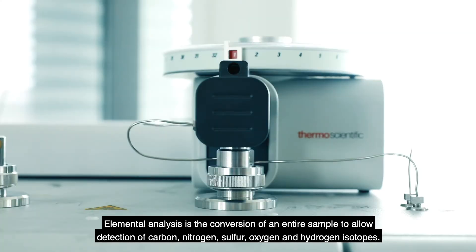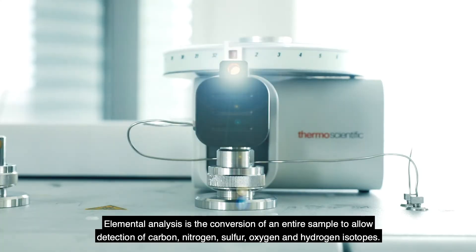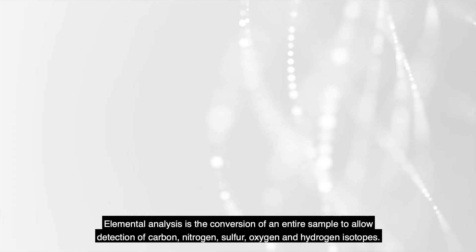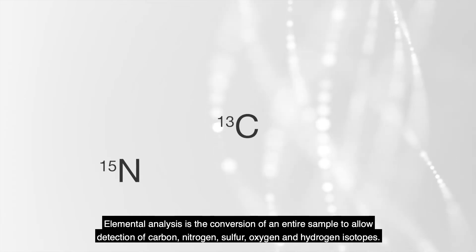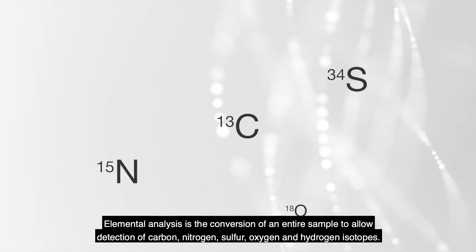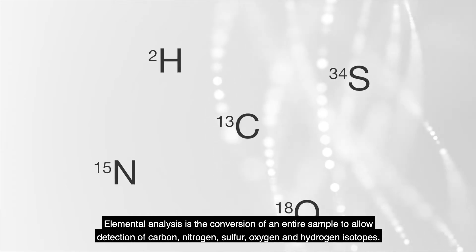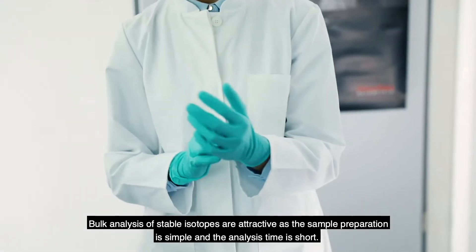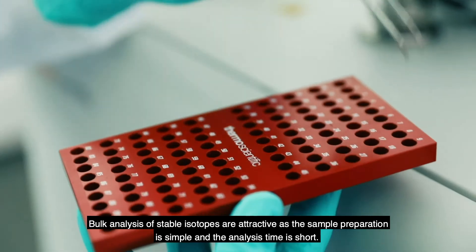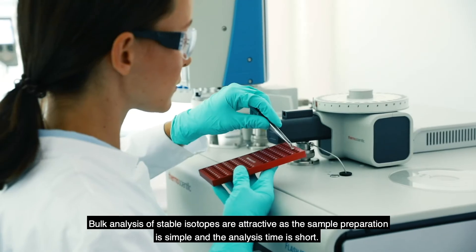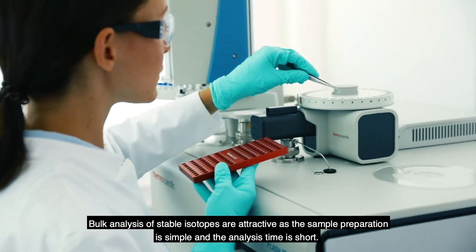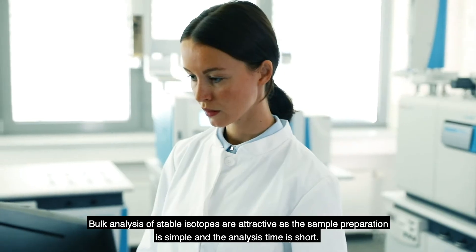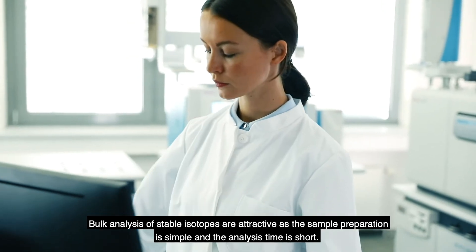Elemental analysis is the conversion of an entire sample to allow detection of carbon, nitrogen, sulfur, oxygen and hydrogen isotopes. Bulk analysis of stable isotopes are attractive as the sample preparation is simple and the analysis time is short.